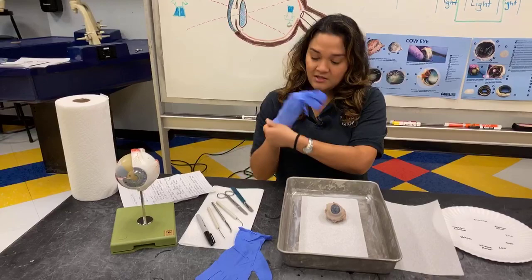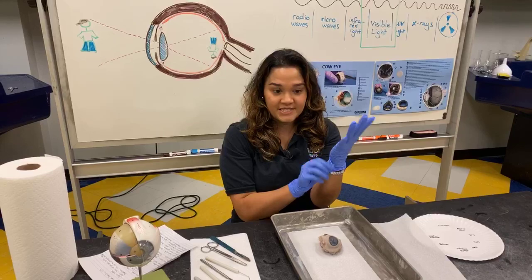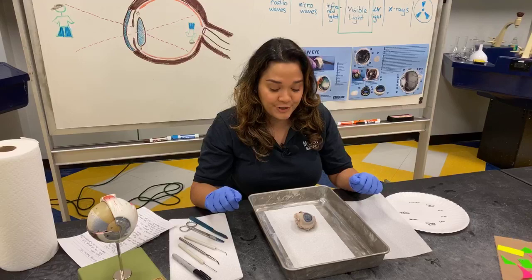So let's get started. I'm going to put on some gloves, because our cow's eye is preserved — it has been sitting in a chemical that could be an irritant, so I want to make sure I'm touching it only with gloves. And because it's been preserved and it's from a cow, there are going to be some differences between our live eye and this preserved cow's eye. As we go through our dissection, I'll point out some of those differences.